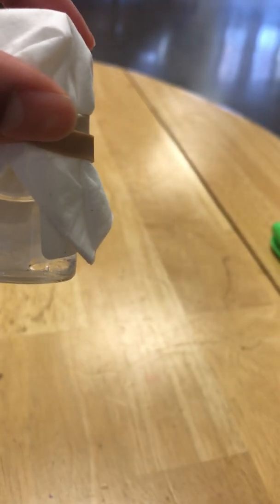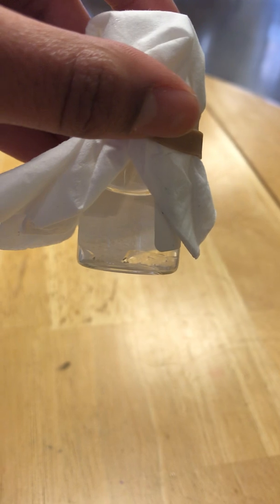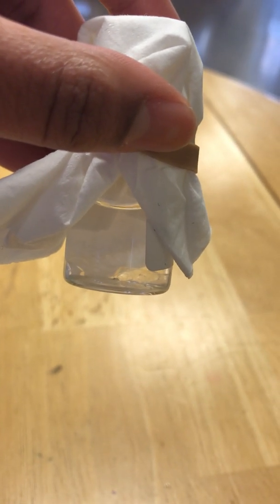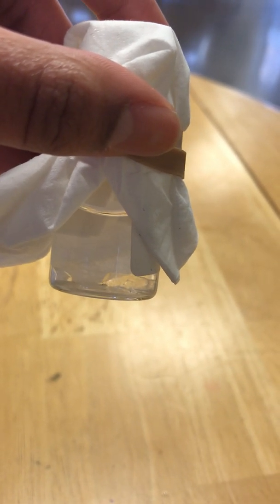However, crystal growth is slower than it would have been at the beginning of the experiment because I did spill some of the solution before filming my last video. And this is important because it means that there's less alum dissolved in the solution, so there's less in the container to form a crystal.